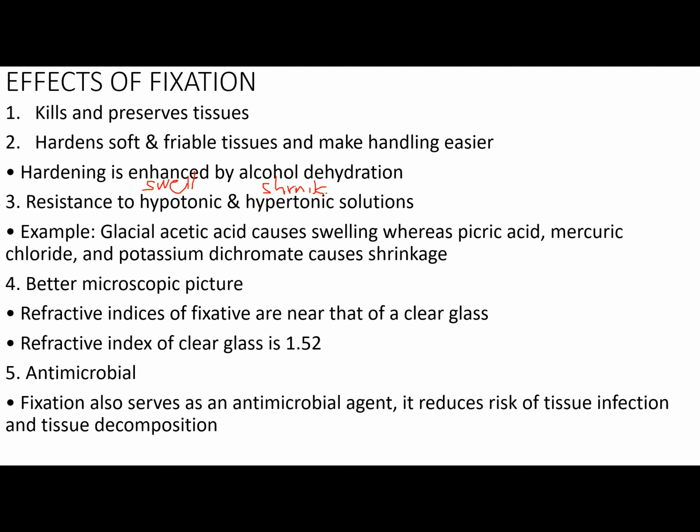So, by doing fixation, you somehow prevent the swelling and shrinkage of your cell, allowing them to maintain their original size and shape. Then another effect of fixation is that it would produce a better microscopic picture. The refractive indices of fixative are near to that of clear glass. So mas magiging better yung pagka-view ng tissues and cells mo, class, under the microscope if you fix it. Then take note that the refractive index of clear glass is 1.52. So almost at that refractive index, class, yung magiging ng tissue mo after fixation.